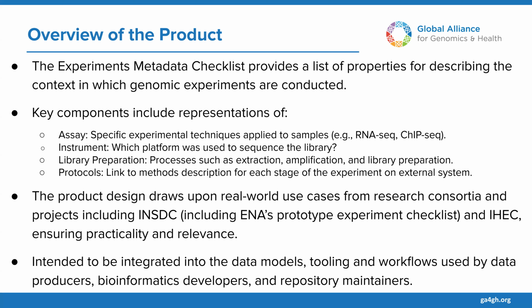Library information, the library preparation. So giving a way to describe processes such as extraction, amplification, library preparation prior to sequencing, and information about the protocols being followed. And this checklist allows you to provide links to versioning systems that would allow you to put a complete description of your laboratory protocol. The checklist itself doesn't list all of the properties or the way to organize information about the protocol.